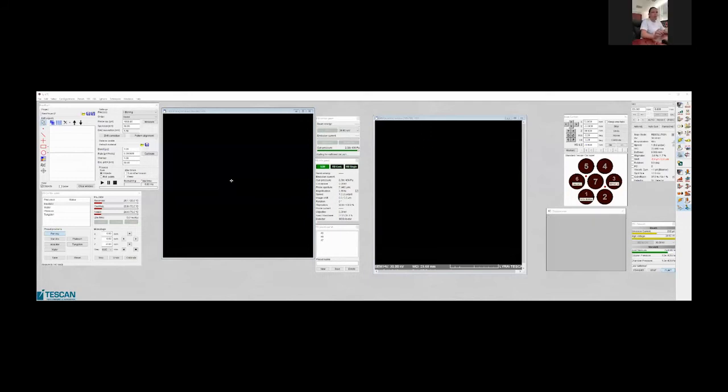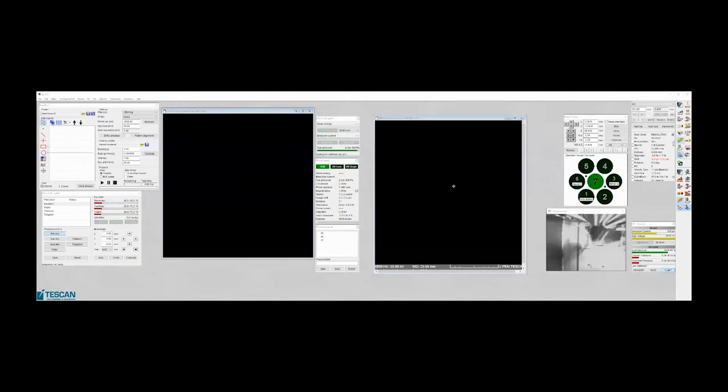So now I have 2 windows here, so you will see both of them. The right part is similar. Oh yeah, now it's somehow clicking because of sharing it. Okay, never mind, hopefully it will not bother you a lot.